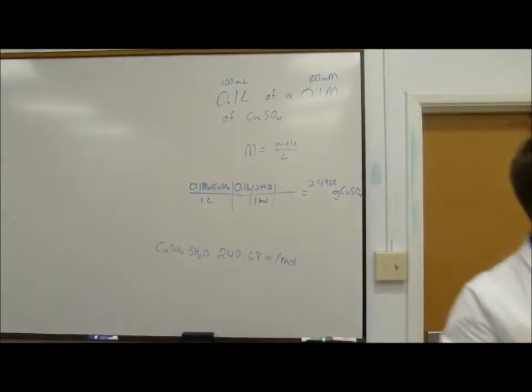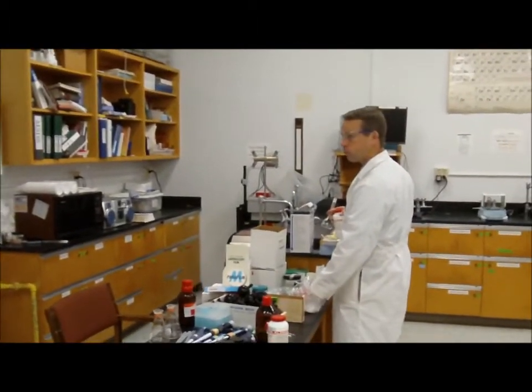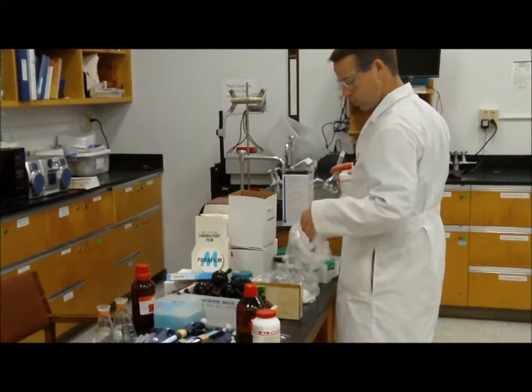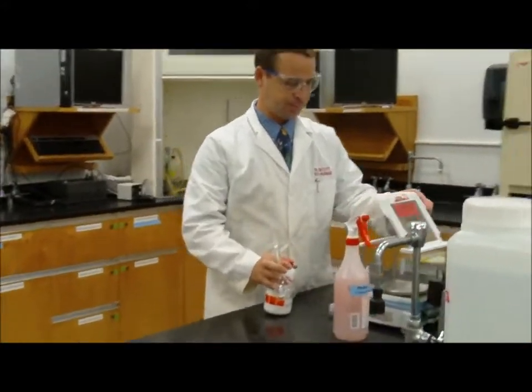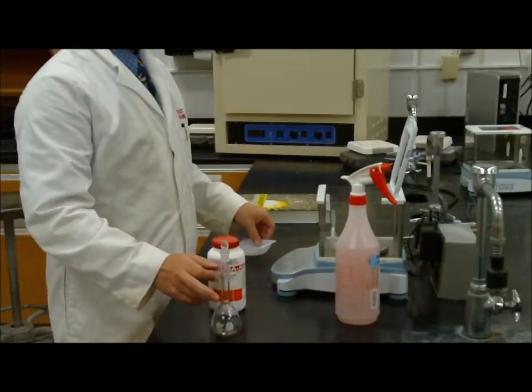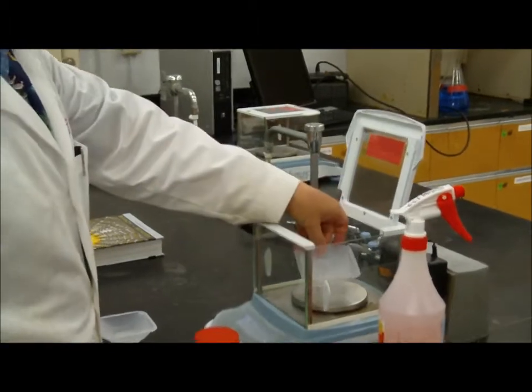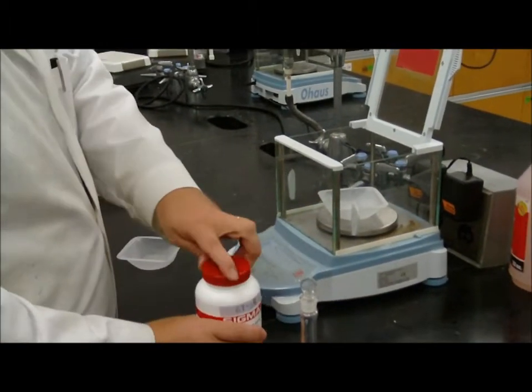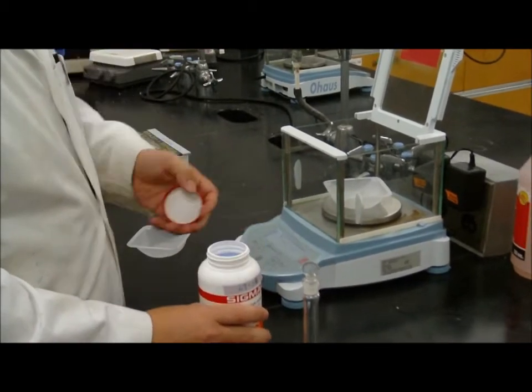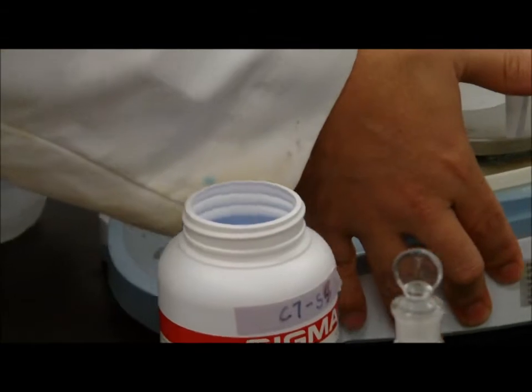So I'm going to go get a weigh boat here. Balance. Compare my balance. I need 2.4968.